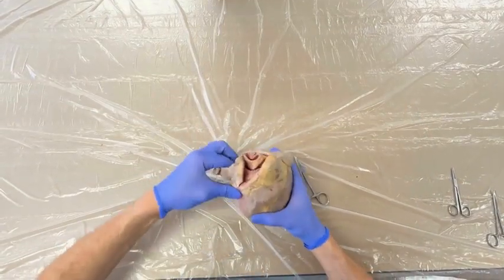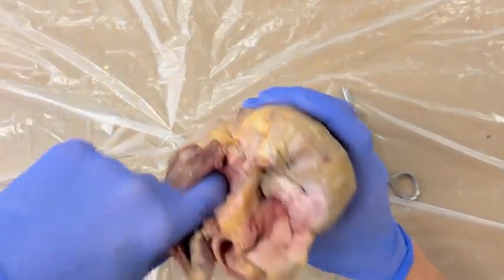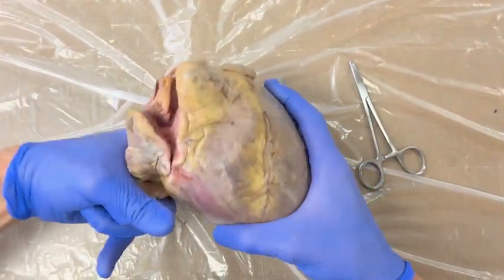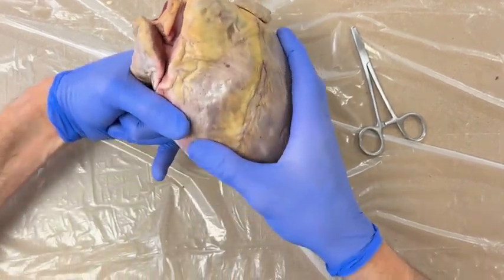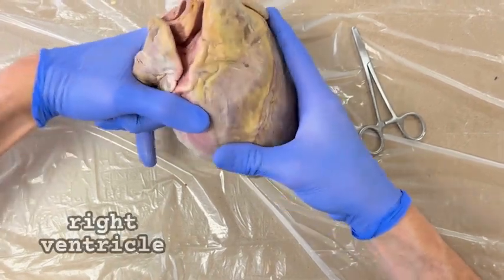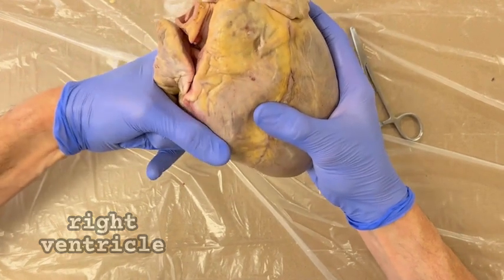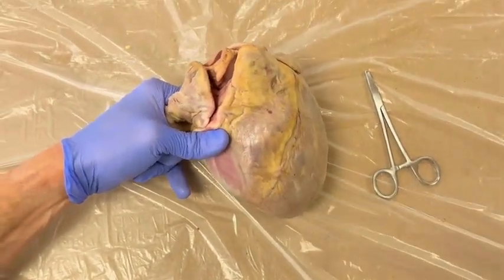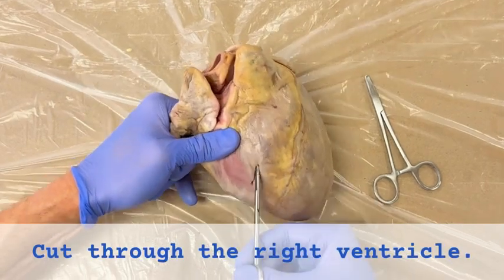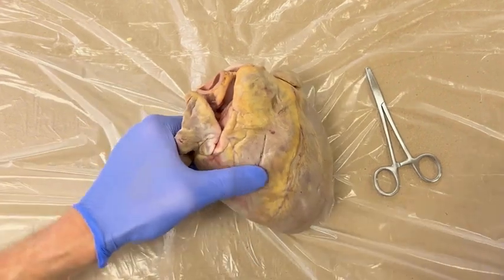The easiest way to identify the right ventricle is to push your finger through the tricuspid valve and into the chamber that is immediately after it. And that represents the right ventricle. And you can see my finger kind of making an indentation in the right ventricle. And I'm now going to take scissors and cut through the right ventricle and open it all the way up.